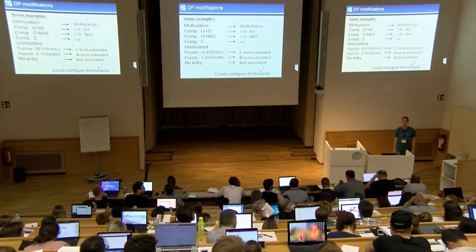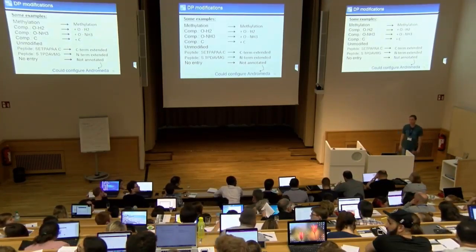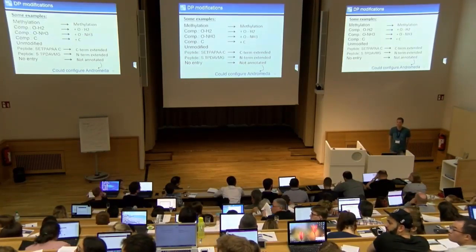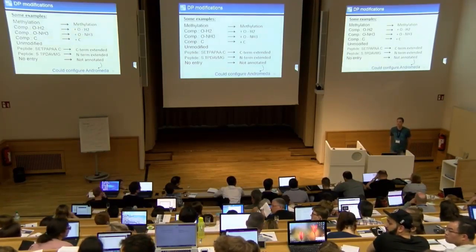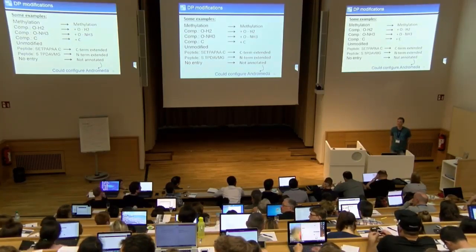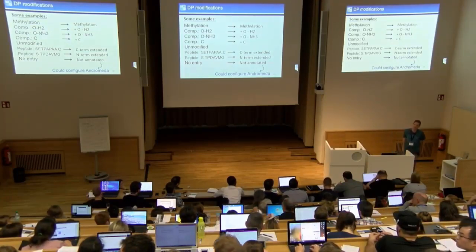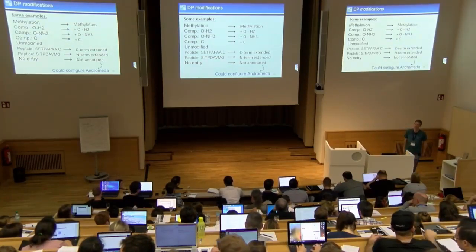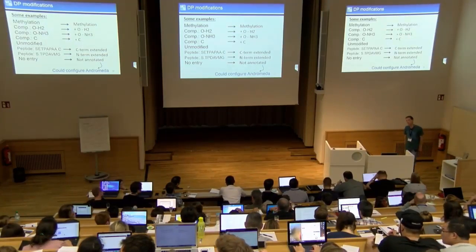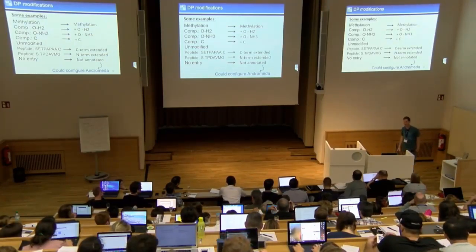Hi, up here. So I understand that when you replace the theoretical peptides with the identified peptides, that of course gives you a better FDR. But in case, for example, of a homozygous point mutation, or a modification that's so abundant that there is no normal peptide left, you would miss that, right? Yes, exactly.